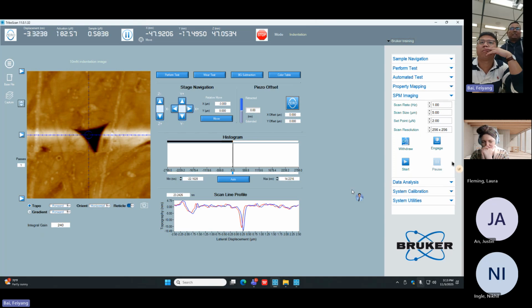We are interested in just an indented mark, so that we can use that groove and deposit something and see in the SEM the thickness that we are going to deposit using ALD or something like that. The surface itself is rough compared to the oxide material that we want to coat on top. So we want to compare before and after to see how much we coat.